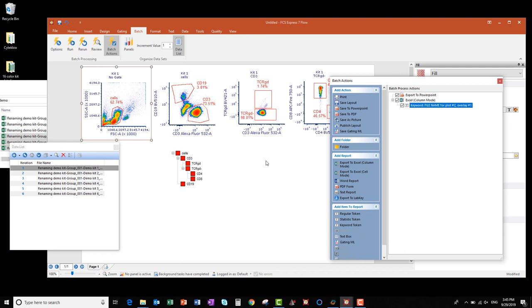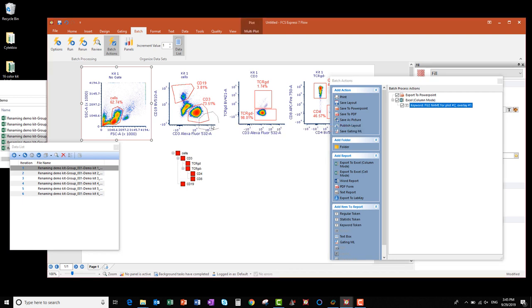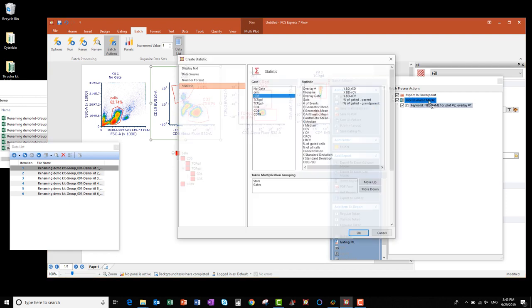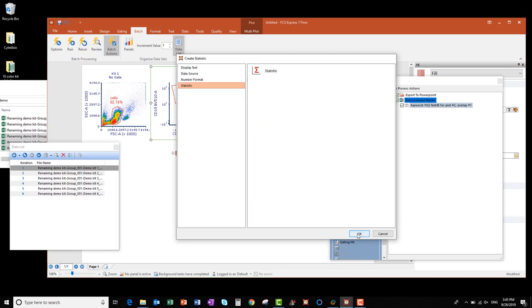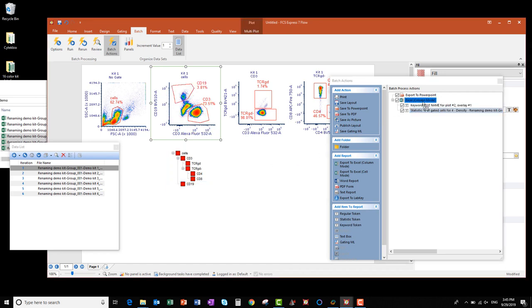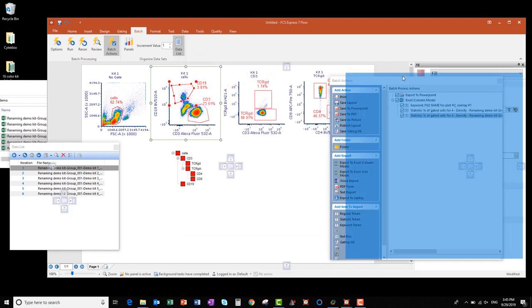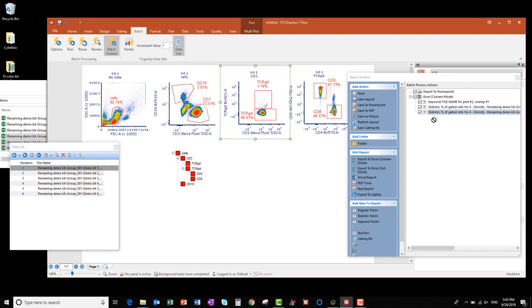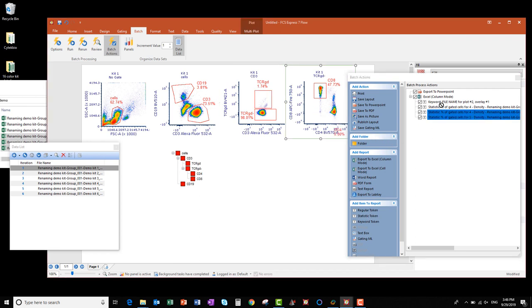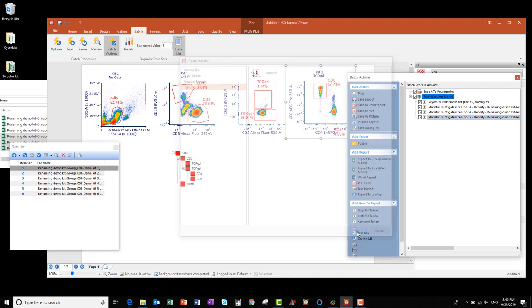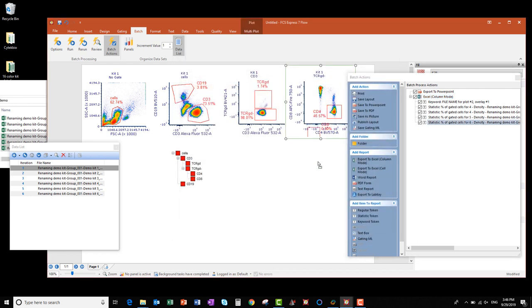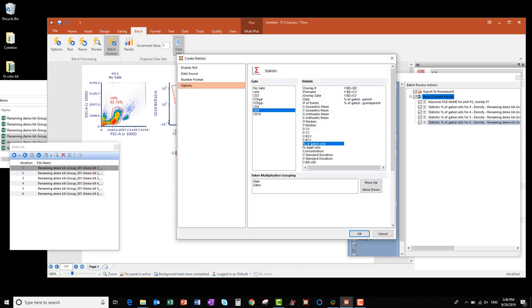Now I want to add some population percentages to the Excel file, starting with %CD3. So I click and drag the CD3 gate to the Excel Column Mode item in the Batch Actions list. I need to select my statistic as % of gated cells and click OK. I'm going to repeat this for my CD19 positive gate, again choosing % of gated cells for CD19, and click OK. I've got four more gates I'd like to add, so I'm going to keep repeating that procedure of clicking on the gate, dragging it to the Excel Column Mode item, choosing the statistic I want, and saving it. You can do this for as many gates and statistics as you'd like in your Excel file output.